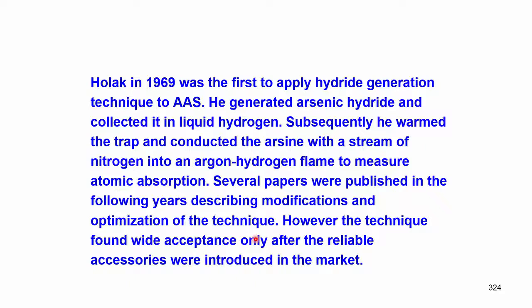Subsequently, he warmed the trap and conducted the arsine, that is AsH3, arsine gas, with a stream of nitrogen into an argon hydrogen flame to measure the atomic absorption. Very simple. Several papers were published later in the following years describing the modifications and optimizing the technique.